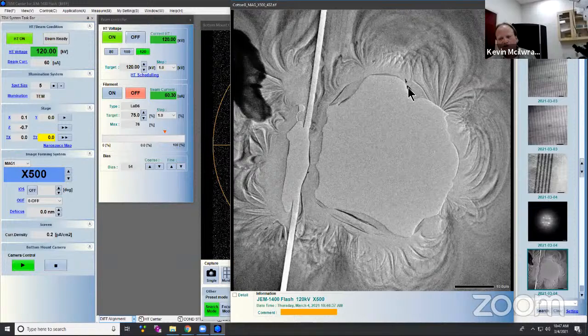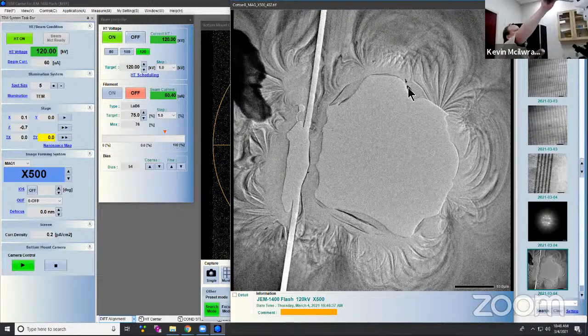So just pull this out real quick. Thank you, Kevin. Another question is about if you can make a live Ronchigram. No, not on this tool because I don't have a STEM. That's right. And then, so if you look here, I have one of these small little tips to go to high tilts. So I'll pull this holder out. Oops. Pull that one in.